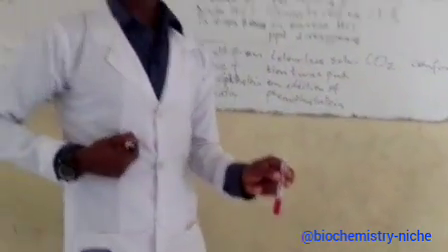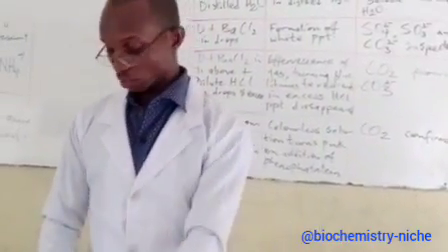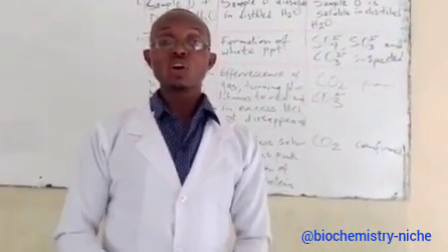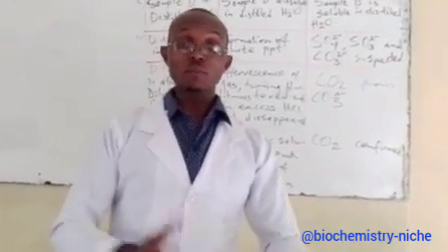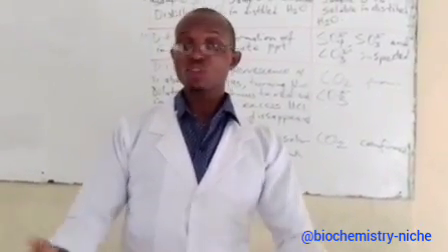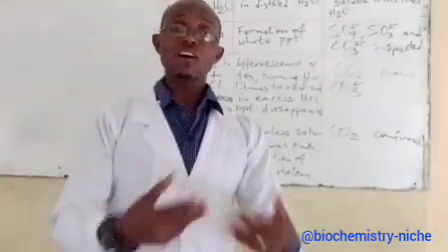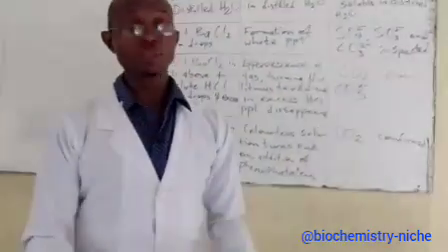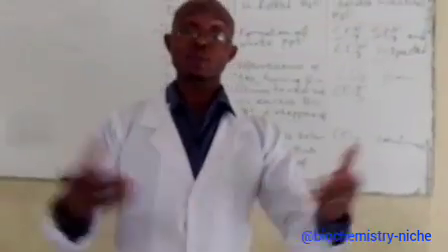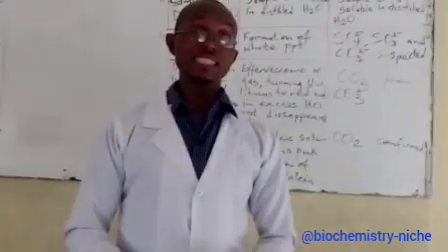So this is possibly what you will be seeing in your exam. You could also be asked to test for some other things, depending on the processes that you are asked to undergo. I have just done this from previous experiments, suspecting that these are the possible things you might be asked to do. In case you are asked to heat your salt, you dissolve your salt and heat it. There are also certain ions that you can suspect and confirm, like potassium ion, sodium ion and the rest of these, and that will narrow it down to a particular ion that is present in the salt.